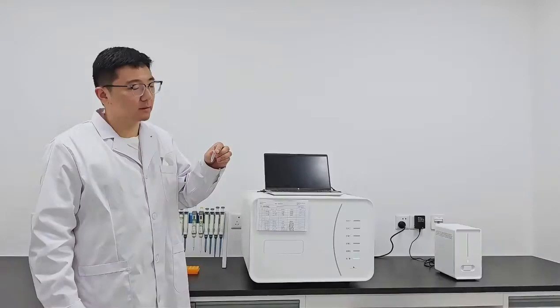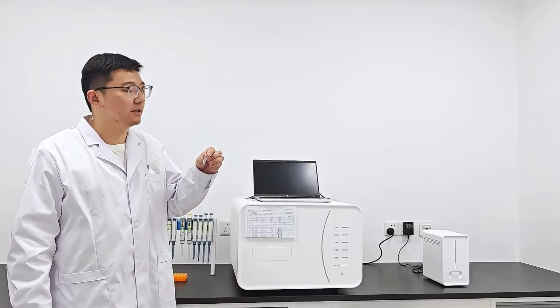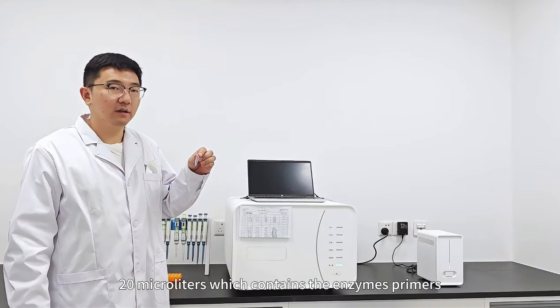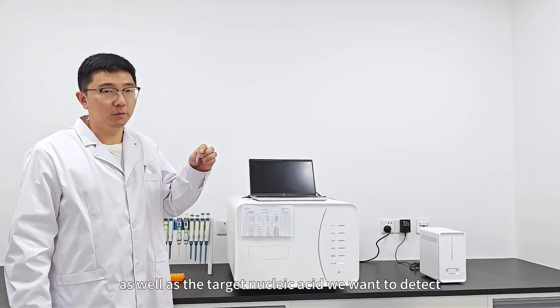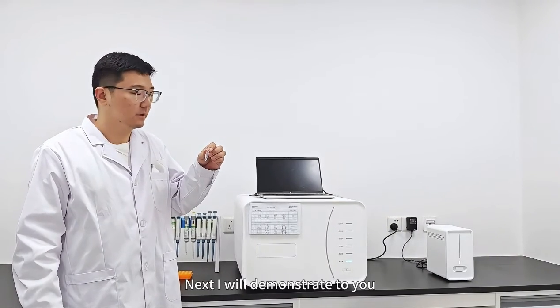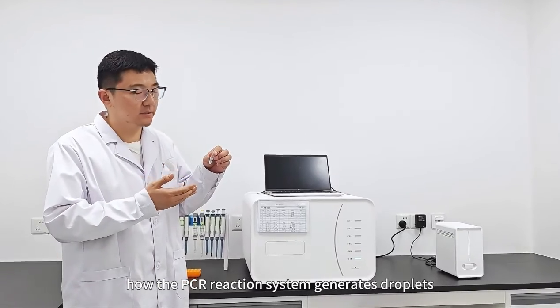amplification. This is the reaction system for digital PCR we just prepared. This system contains a total of 20 microliters, which contains the enzymes, primers, probes required for digital reactions, as well as the target nucleic acids we want to detect. Next, I will demonstrate to you how the PCR reaction system generates droplets.